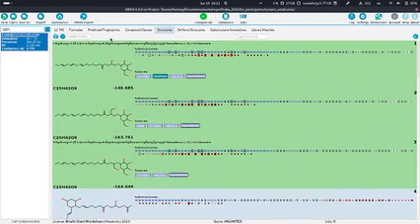And this means that all these structures are very similar and have an MCS distance, if you are interested in the details, of not greater than 2, which means that basically to get from one molecular graph to the other, you would need to delete fewer than or equal 2 edges. So these are very similar.